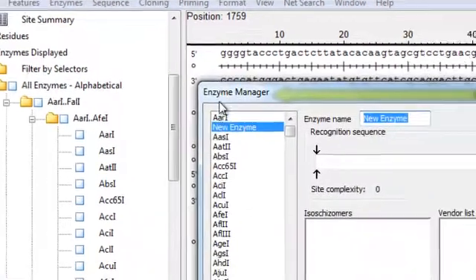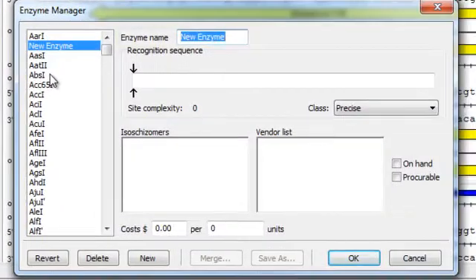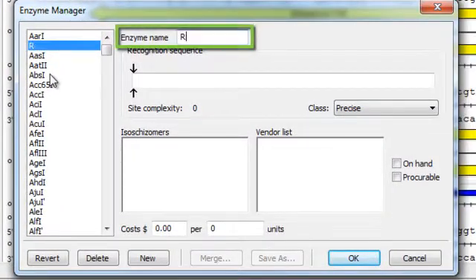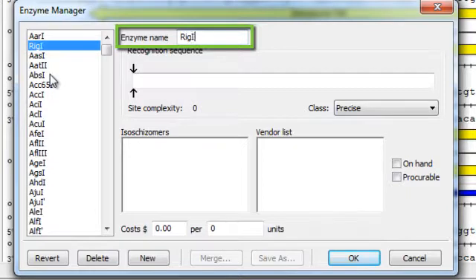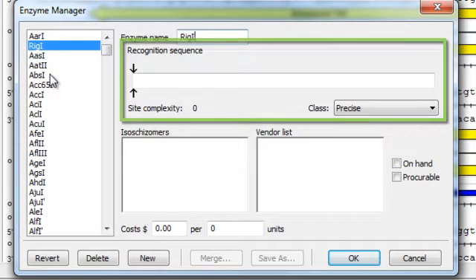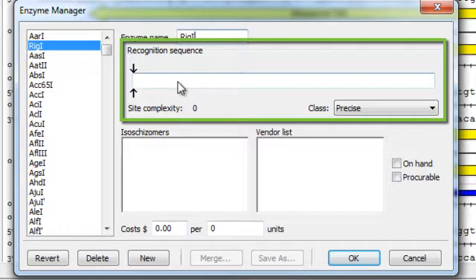This opens the Enzyme Manager. Here you can type in the name of your enzyme. In this example I'm going to use Rig1, and then the recognition sequence.